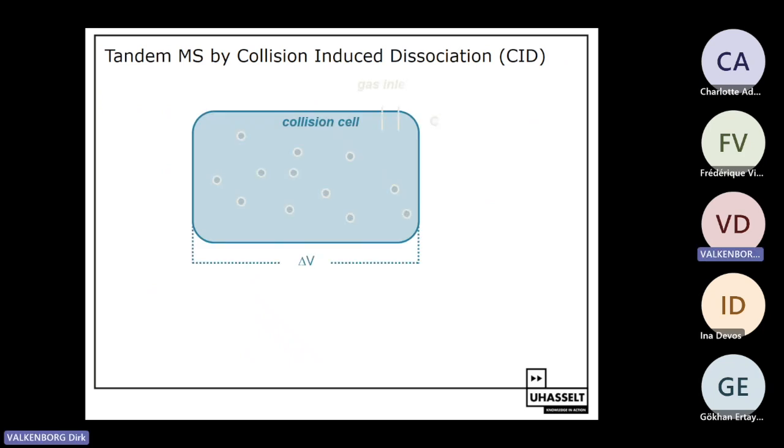So it is a little bit the game of population statistics that we're playing. Let's have a look how this exactly works. In our mass spectrometer, we have a certain region where we allow some gas inside the vacuum. The vacuum here is not that deep, and you can see here our nitrogen atoms positioned in our collision cell. They're just randomly moving around there.